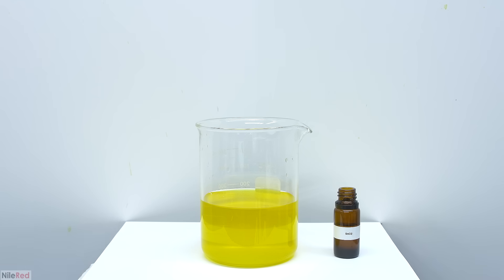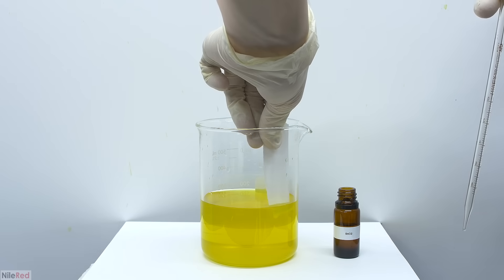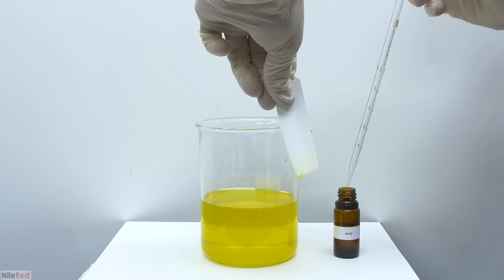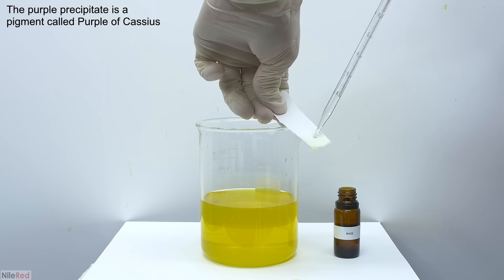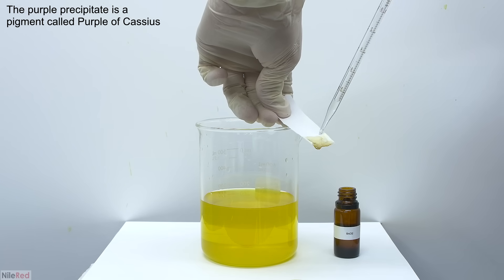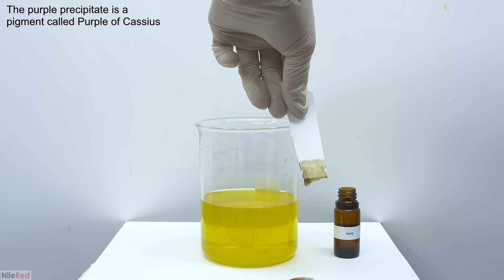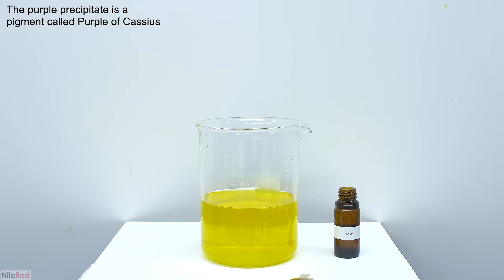Earlier in the video I mentioned something called the stannous chloride test and here I'm going to demonstrate what that is. I take a piece of paper and dip it into our gold solution, and then add a little bit of stannous chloride. Stannous chloride reacts with gold in solution to form a purple precipitate. We're using it here to test for the presence of gold, but it can also be used to differentiate between different precious metal solutions. With gold we get a dark purple, almost black color, but with something like platinum we can get a yellow or brown color.